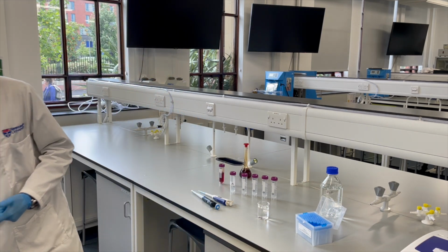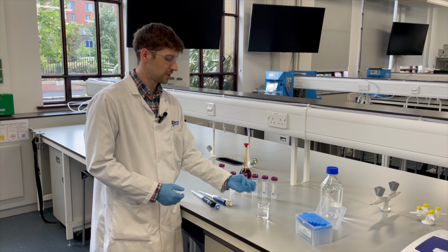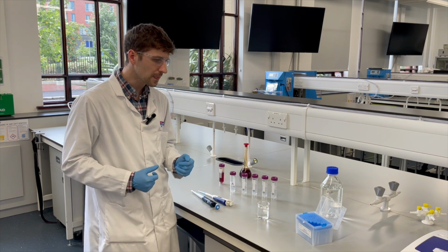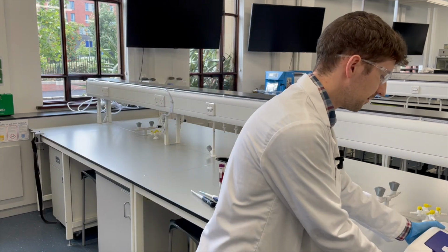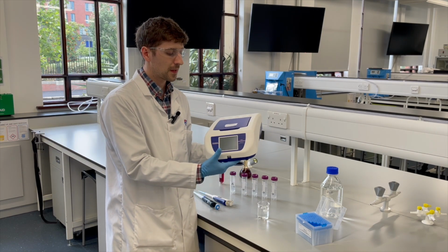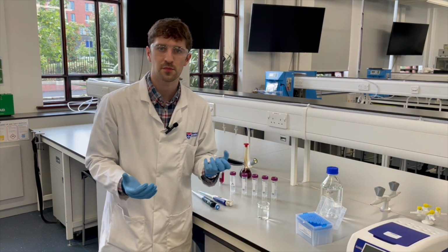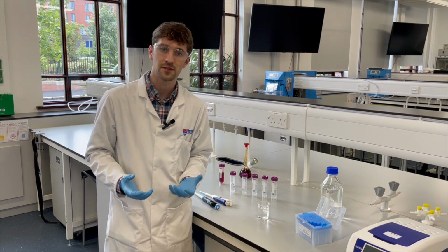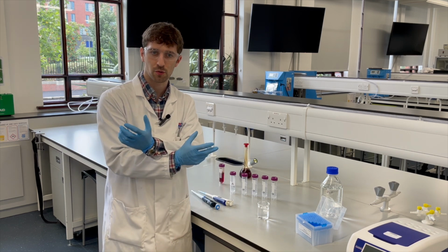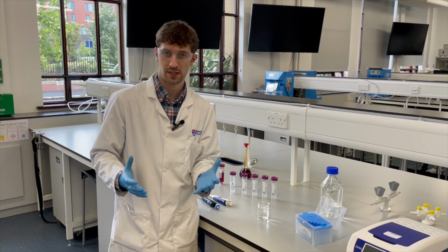Well, of course, we can put the aspirin tablet into the water, and then we can withdraw some samples of the solution at different time points, 5 minutes, 10 minutes, 15 minutes. And then we can place that solution into our UV spectrometer. The UV spectrometer doesn't tell us the concentration of aspirin in solution. It tells us the absorbance of that solution.